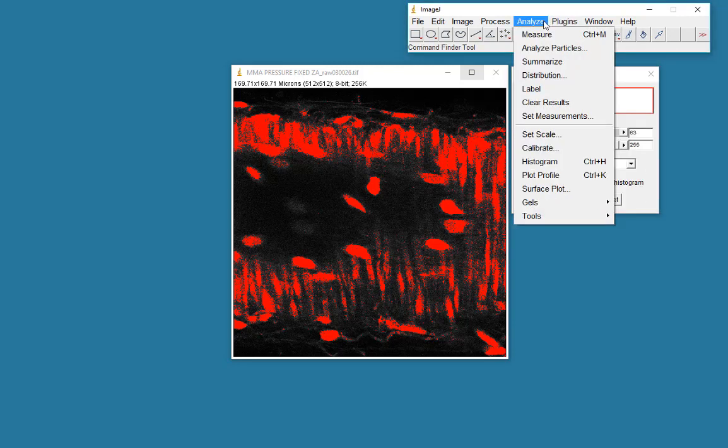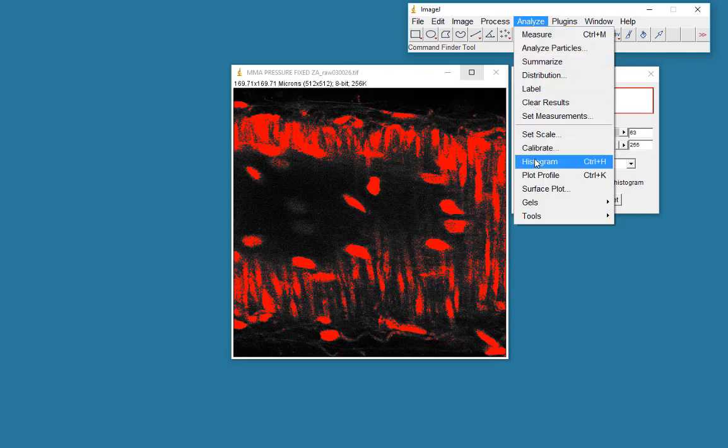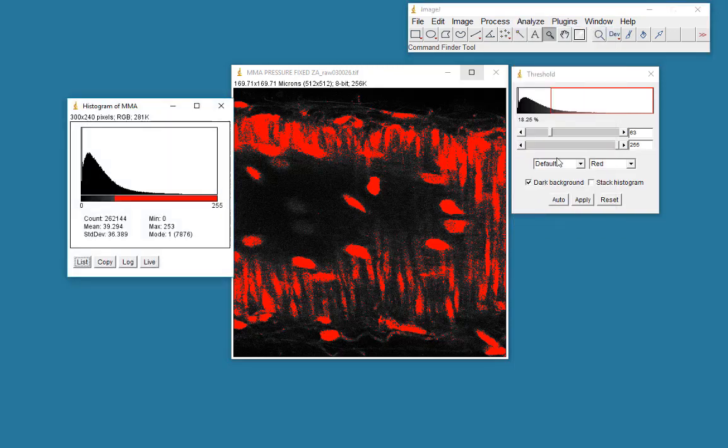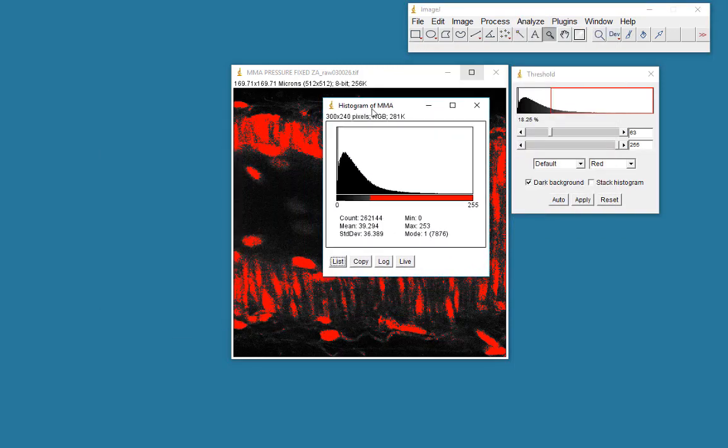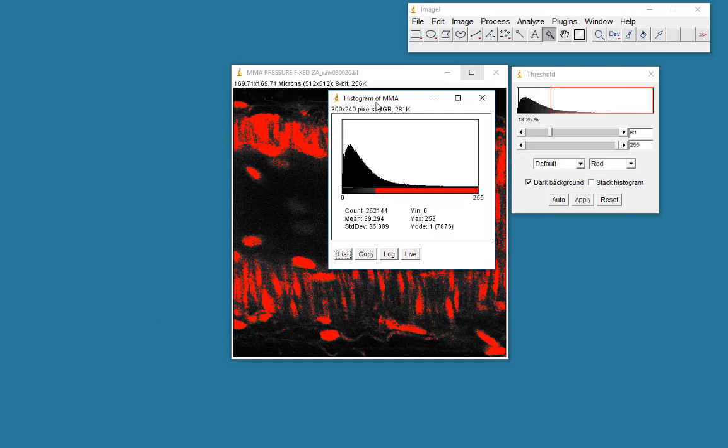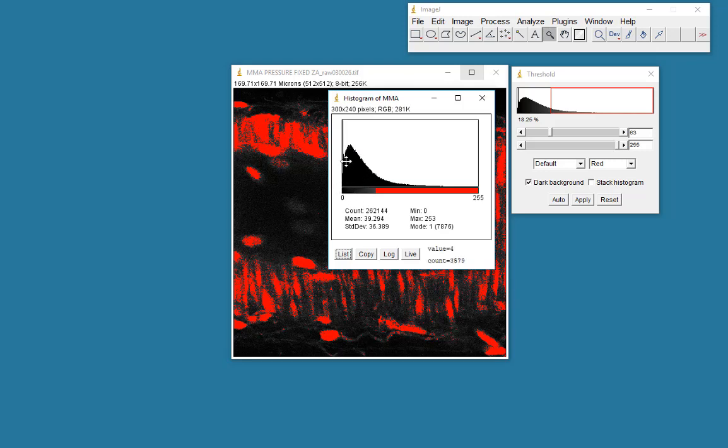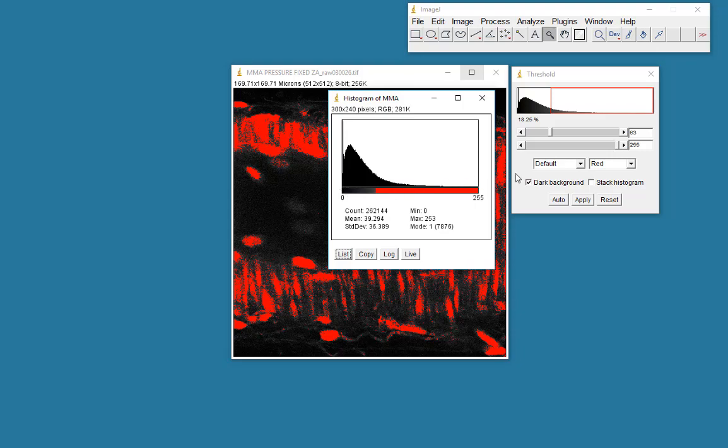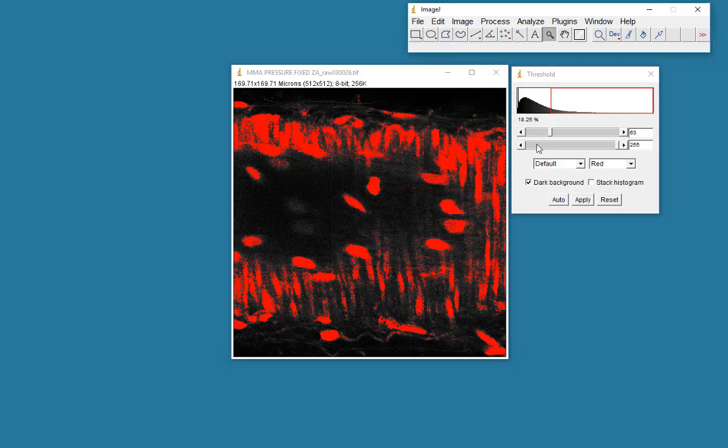Let me find the histogram option. If I go to Analyze Histogram, here we have the same histogram, just a slightly different scale. What this tells us is the number of pixels at a particular intensity. So you can see here at 255 at this range. So imagine there's a greyscale running here. I'll switch the threshold off for a second actually.